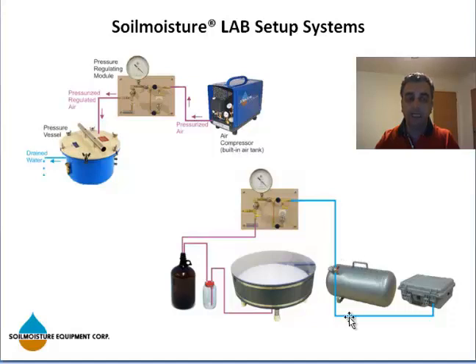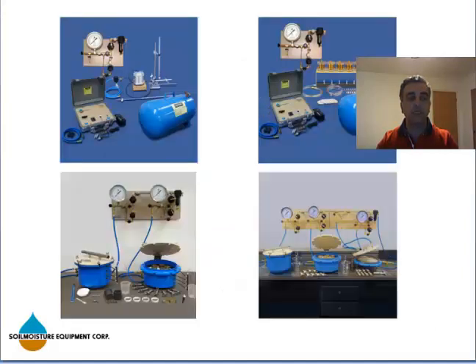Our air tank has a safety valve. The model number is 1980 and the color is blue. Here is gray, but the standard color is blue. Let me see. I guess I have the picture here somewhere. Yes, just to show you, this is our 1980 air tank that the application range of it is from -1 bar to +8 bar of pressure.